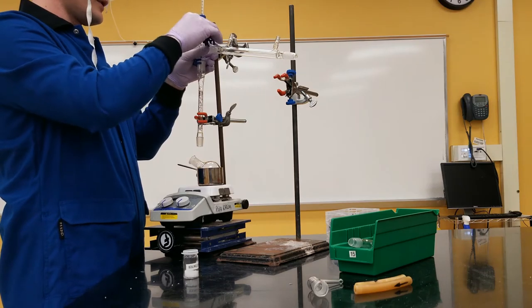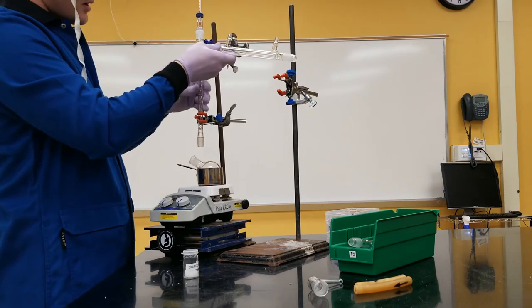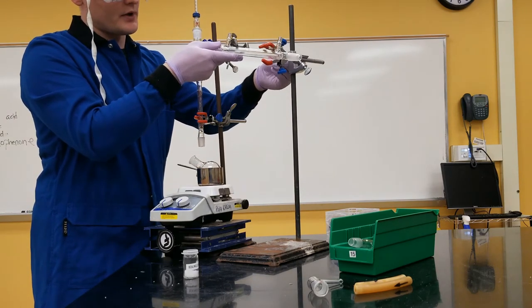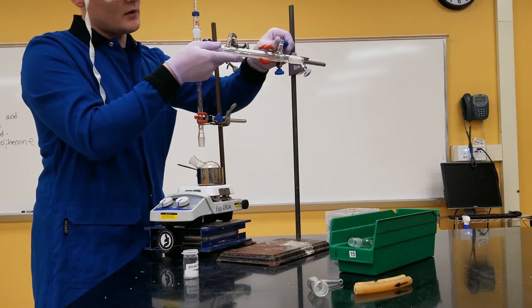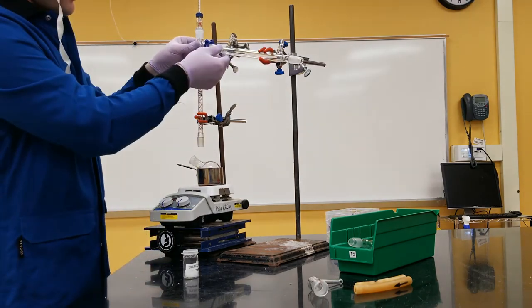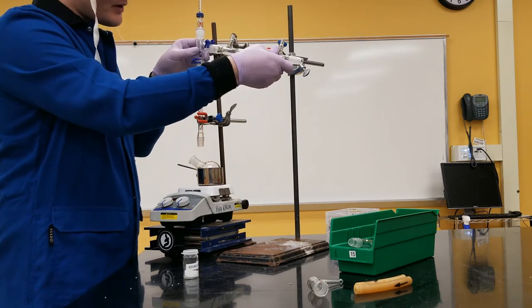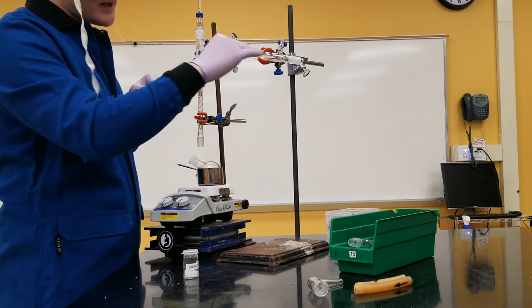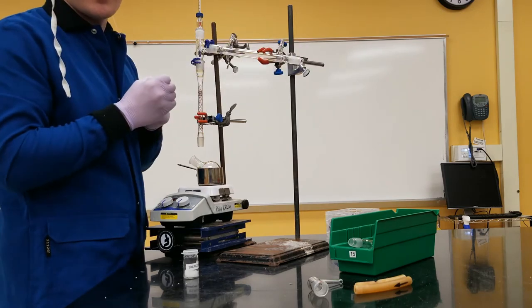I'm gonna hold on to that with a piece of plastic clamp here. And I'm going to bring this claw up to support it. And it might look a little off kilter, and there's a reason for that. I want this column to be straight up and down. That's how it's going to most effectively separate out my solvents and run effectively. I want this tube where I'm collecting and cooling those vapors to be slightly slanted downwards, because I'm going to collect it at this end and I just want to form drops up here that can slide down. So this needs to be slightly downward.